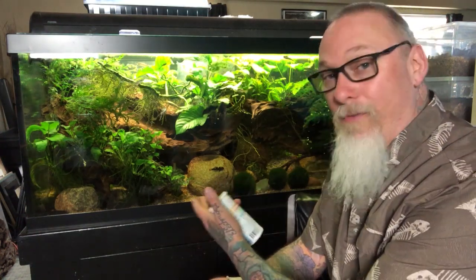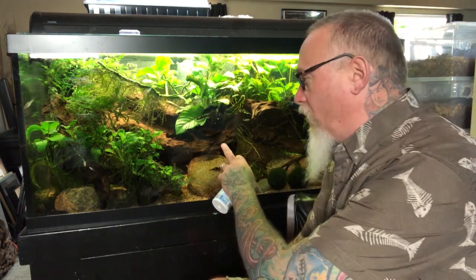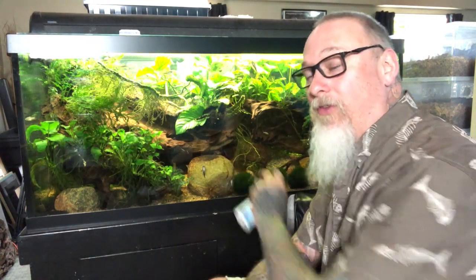I use well water or reverse osmosis water — in this case, strictly reverse osmosis water, and then I buffer it to where I want it to be. But with the addition of fish or life, they're going to produce waste products, and those products will start to degrade the water quality. The addition of things like driftwood and bogwood will also alter the chemistry of the water. So to really be truly accurate and know what we're dealing with before a potential problem emerges, it's really advisable to test our water.